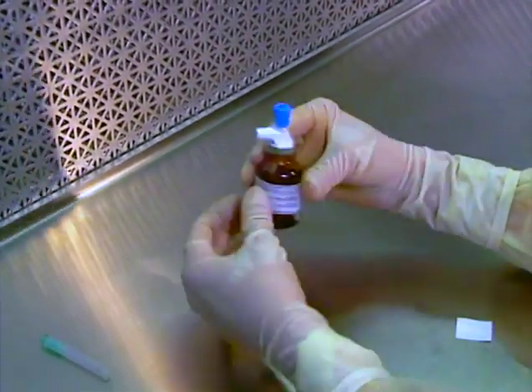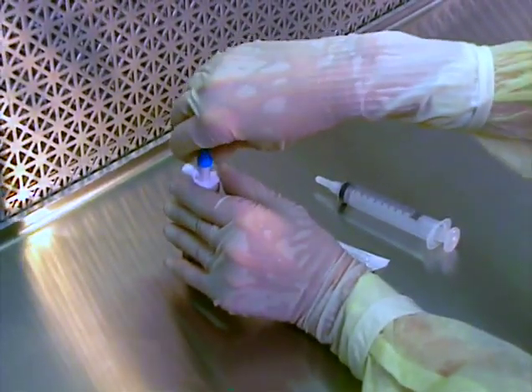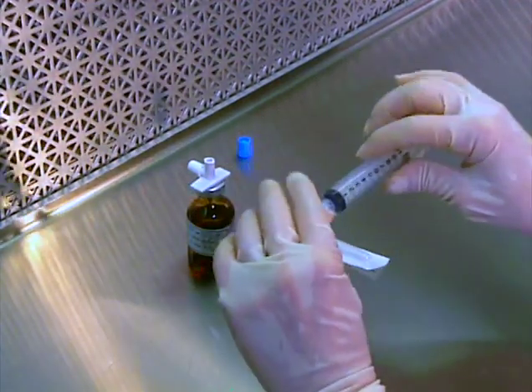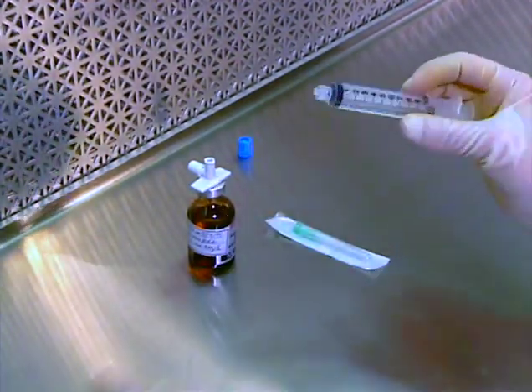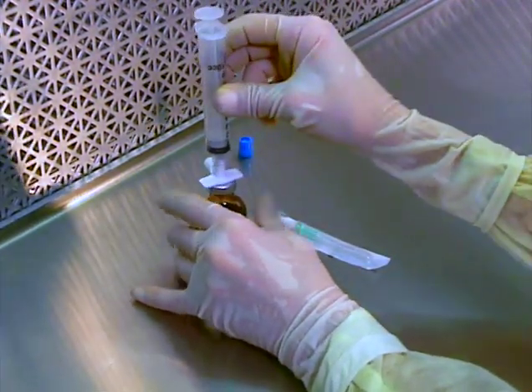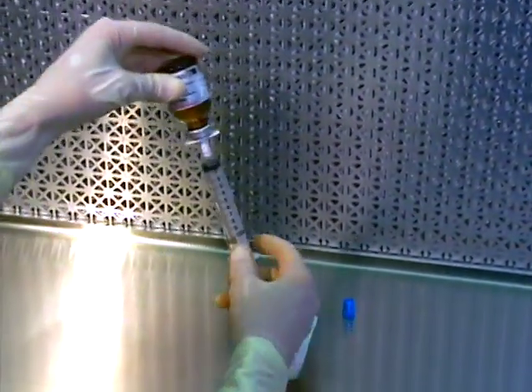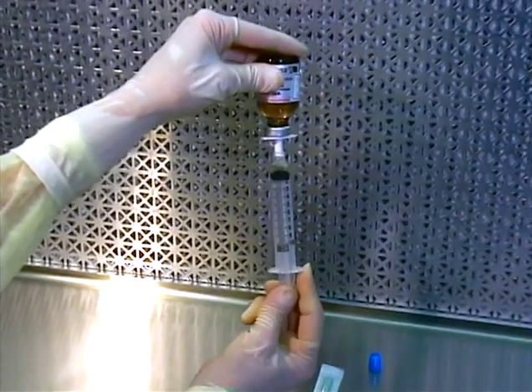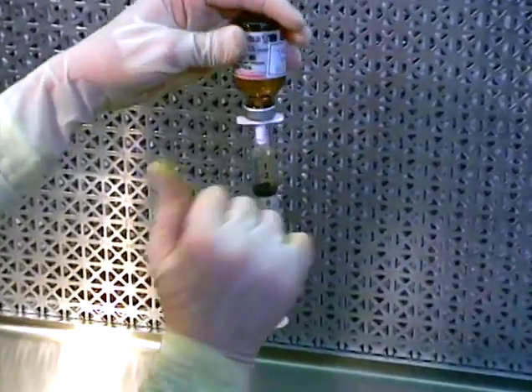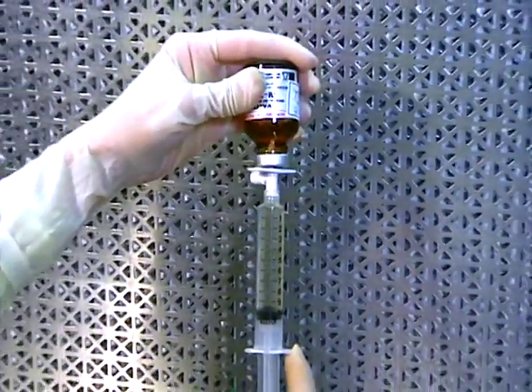Place an ID label on the vial. When ready to withdraw the drug, remove the cap aseptically and place it in first air, inside up. Remove the hub cover from the syringe and twist it onto the dispensing pin hub. Invert the assembly, keeping the critical sites in first air. Withdraw the required dose. Remove any bubbles and make the final dosage adjustment.